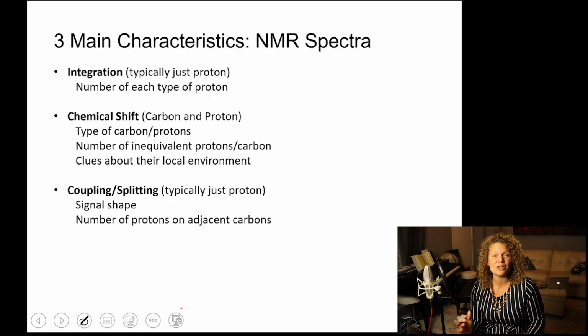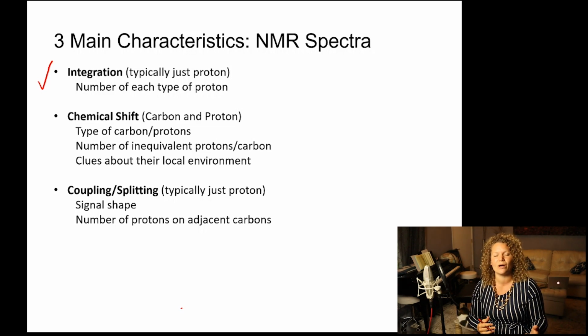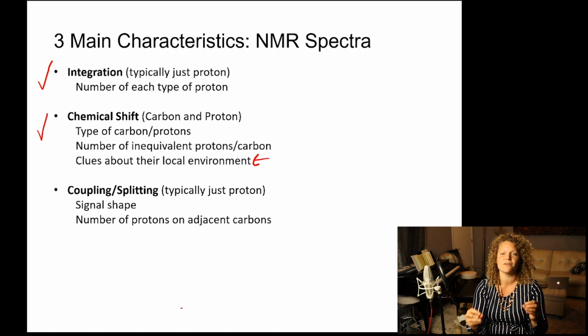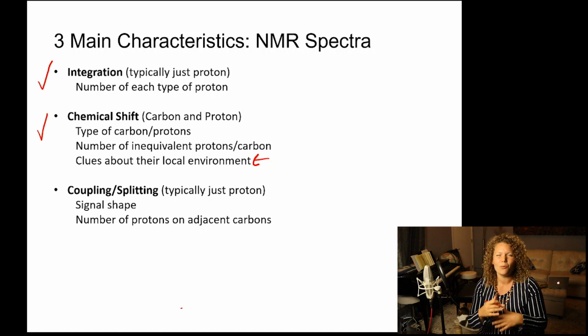That's right. Today we're going to be going over chemical shifts with NMR spectra. We've already done integration and we understand what non-equivalent protons look like. We are now going to move on to chemical shifts. This is going to tell us a lot of information about the environment around the atom that we're looking at. What is bound to that atom? What kind of groups does it have bound? Electron withdrawing or electron donating groups? And where does this signal now take place in the NMR?